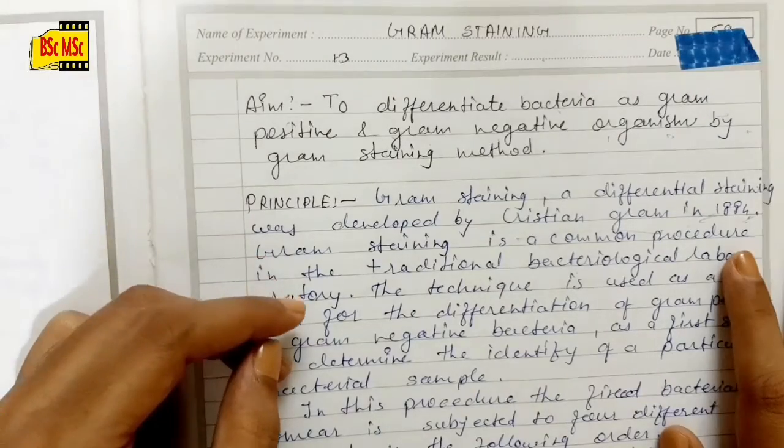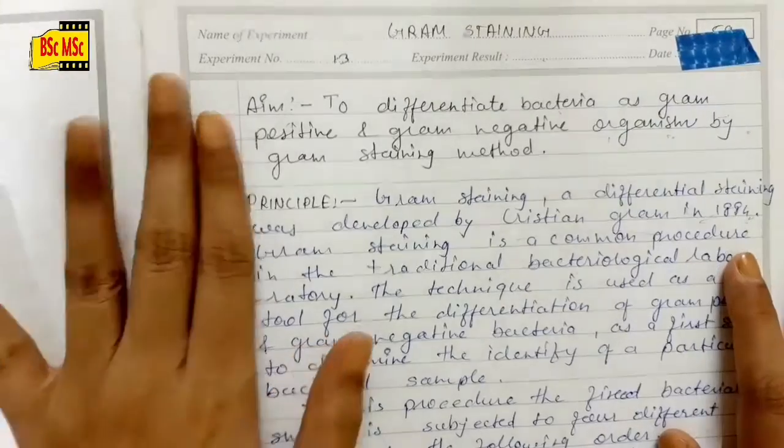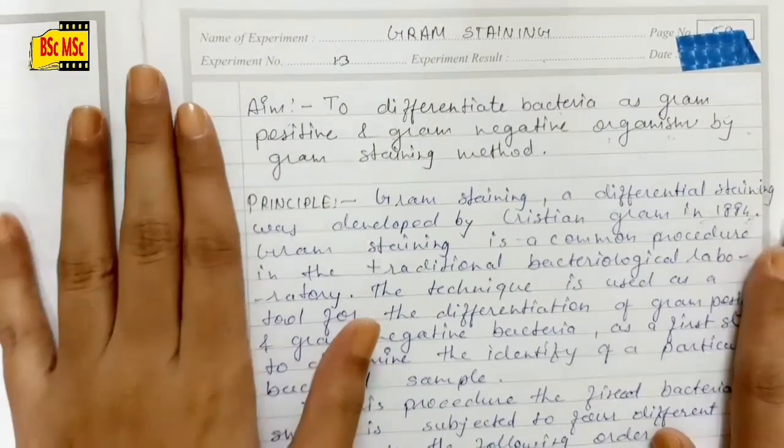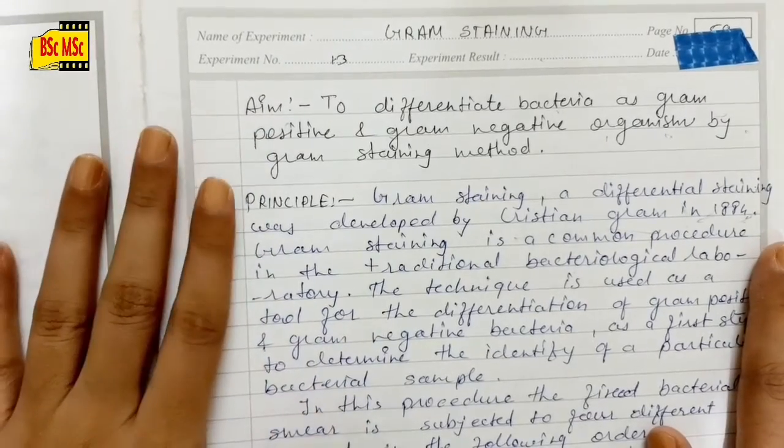Today I'll be teaching you the gram staining experiment and how to write this gram staining experiment in your practical record. This is my practical record, so you can see I have included topics.